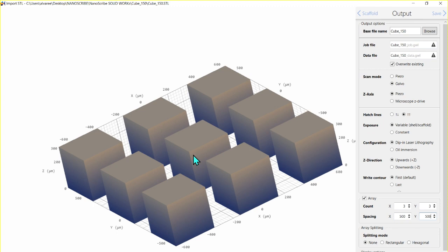And I will explain in another video. Okay? But if your structure is fitting here, you can do the array. If your structure is bigger, and we are going to do it now, I want to explain to you how you can divide it in the different blocks.